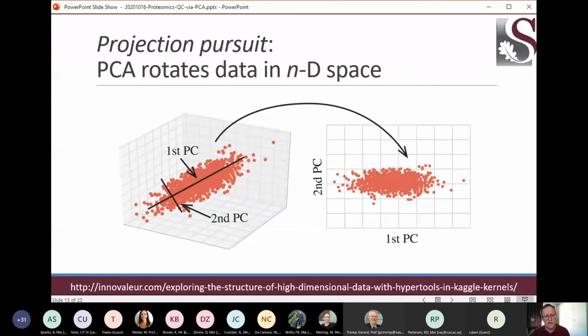As you look at this cloud of dots, you can see that if you look at it from here, you don't have a huge amount of variance. But if you turn it sideways, this cloud kind of separates from left to right. And you can say, ah, that's the biggest variance I have in this set. And if it's kind of tall this way, then if we were to look from left to right that way, we would also see more variance.